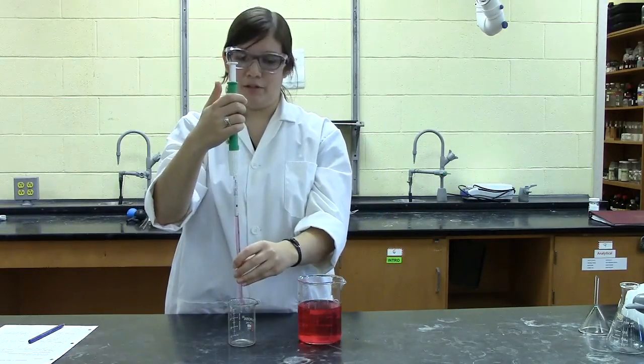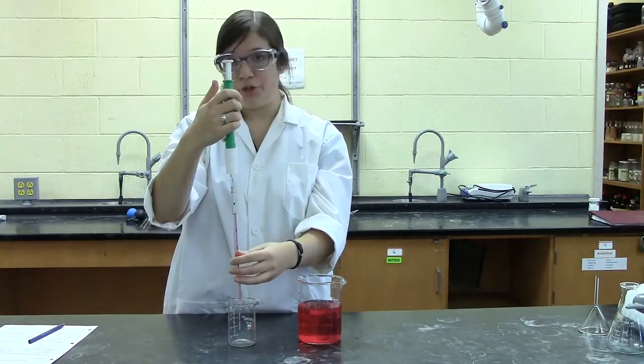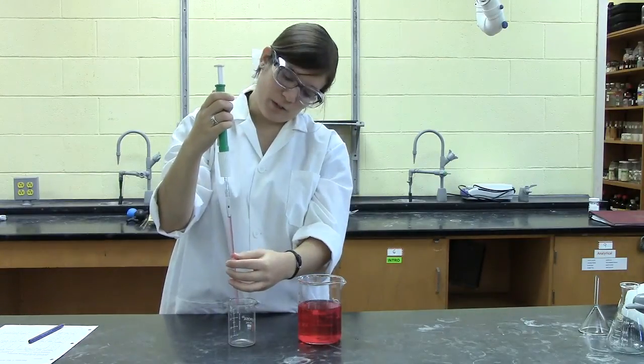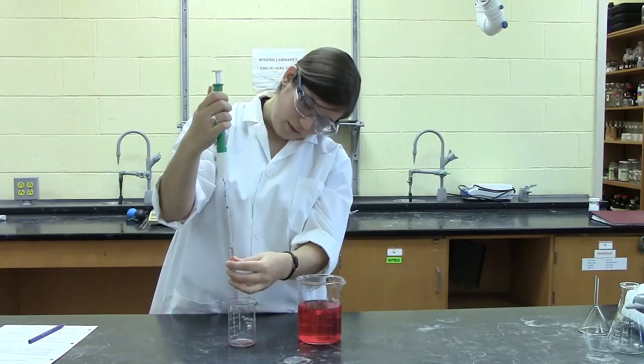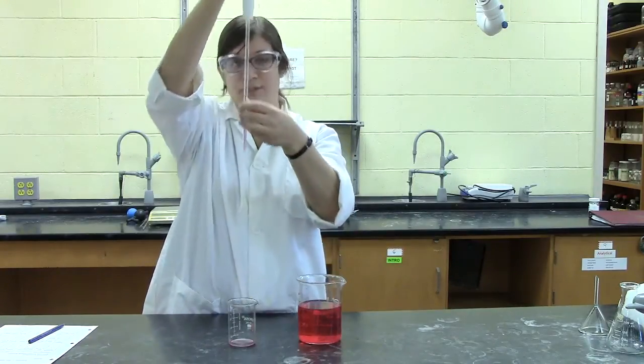Once you have it leveled to the zero mark, if you want to add, say, 2 mL, you can just use the wheel in the opposite direction to lower the meniscus down to the 2 mL mark. And that's your correct volume.